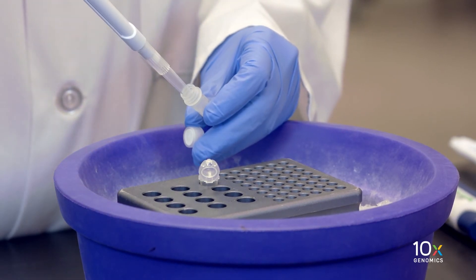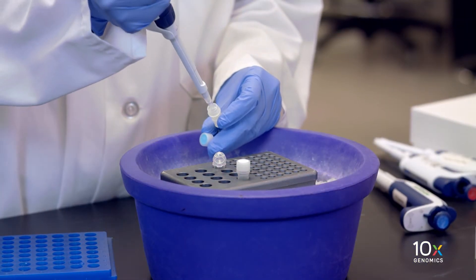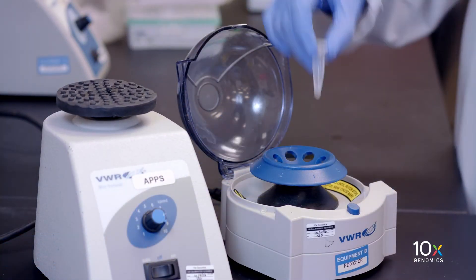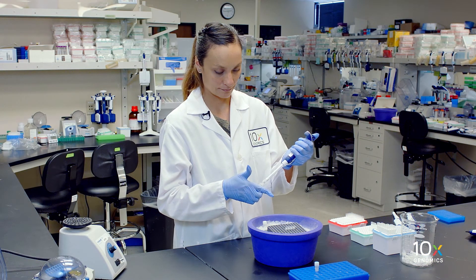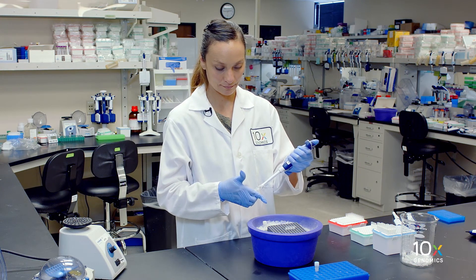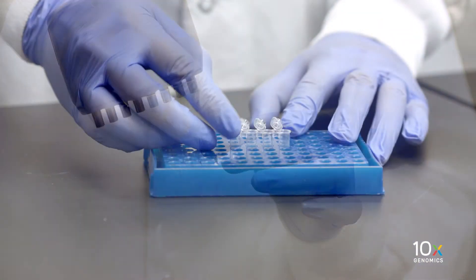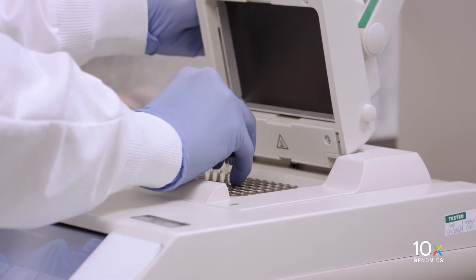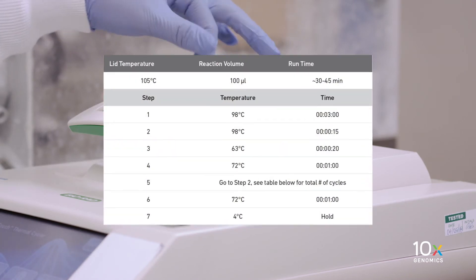First, we will add the amp mix to the tube. Then, we add the cDNA primers we selected previously. Vortex thoroughly and briefly spin down. Add 65 µL cDNA amplification reaction mix to each tube containing 35 µL of purified GemRT product. Pipette mix 15 times and briefly spin down. Load the tube strip into a thermal cycler that can accommodate at least 100 µL reaction volume, and proceed with the following incubation protocol.